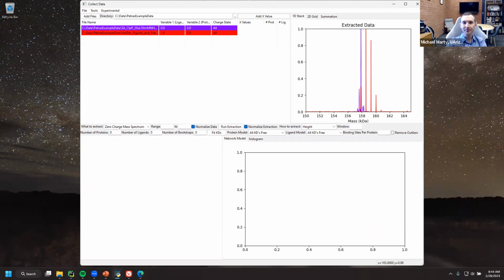It's all vector, so it's not pixelated, the trace. Okay. Yeah. Perfect. And in the main UniDec window, you just middle click and then save as. Yeah. Okay, that's awesome. I was looking for that feature for ages. Yeah. You can also save them all under the File menu. So you do File, Save All as EPS, right? It'll generate that. There is a save figure dialog where you can tell it the size and the transparency or whatever. But yeah, middle click is the easiest.